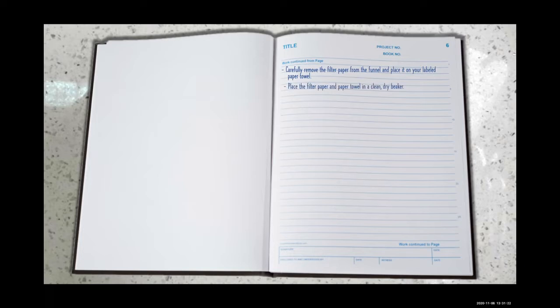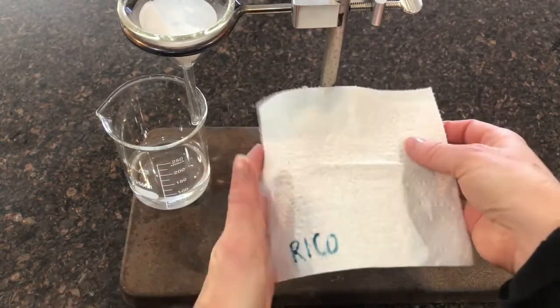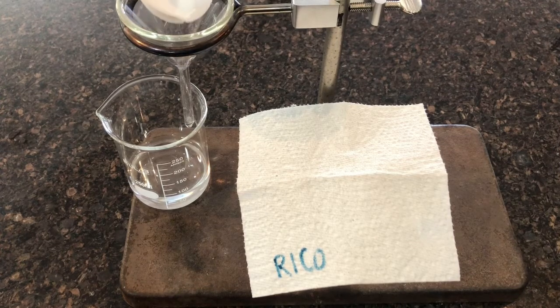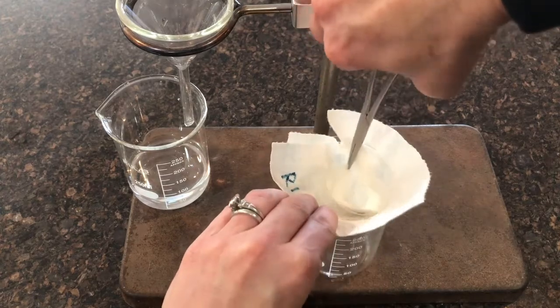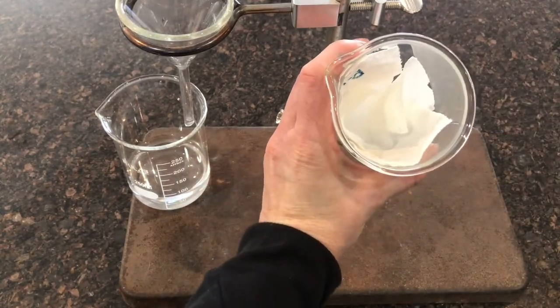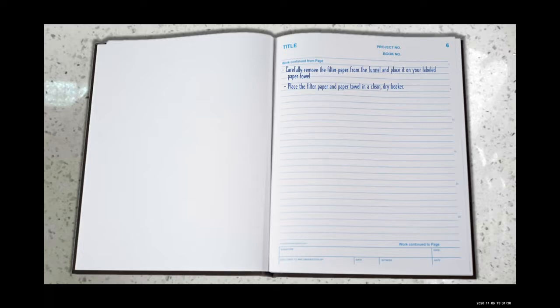Place the filter paper and paper towel in a clean, dry beaker. Place the beaker in a drying oven overnight.